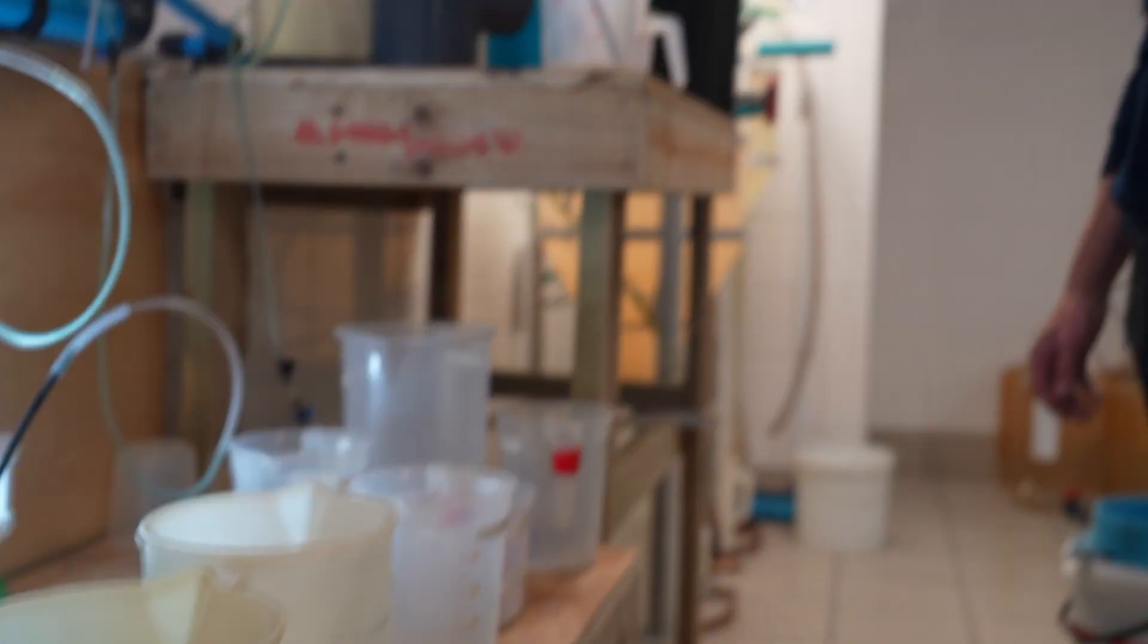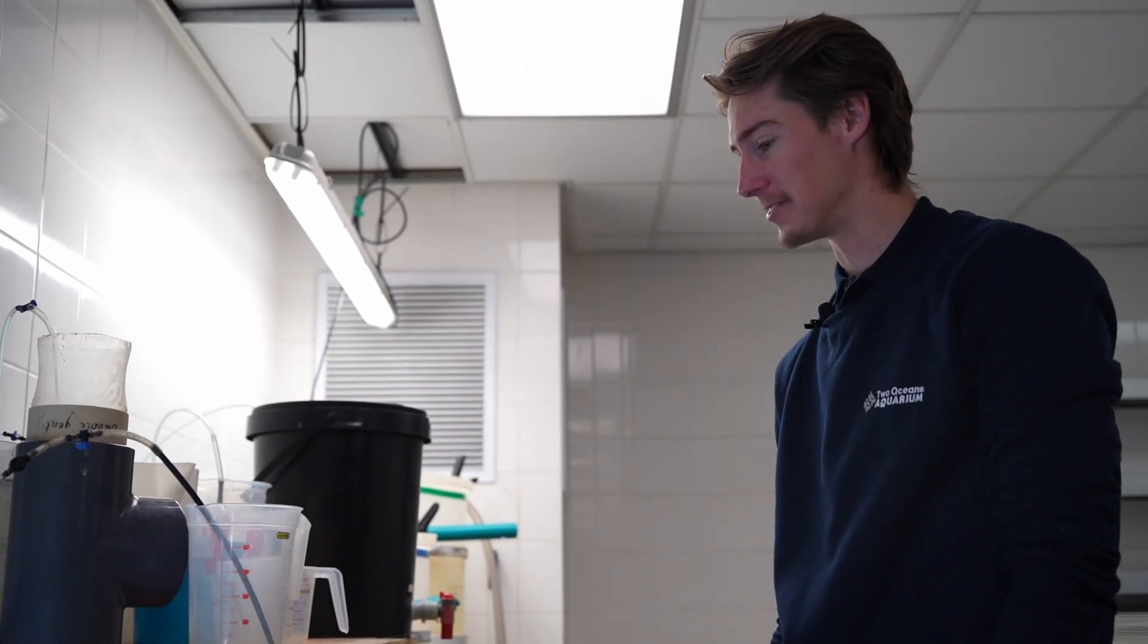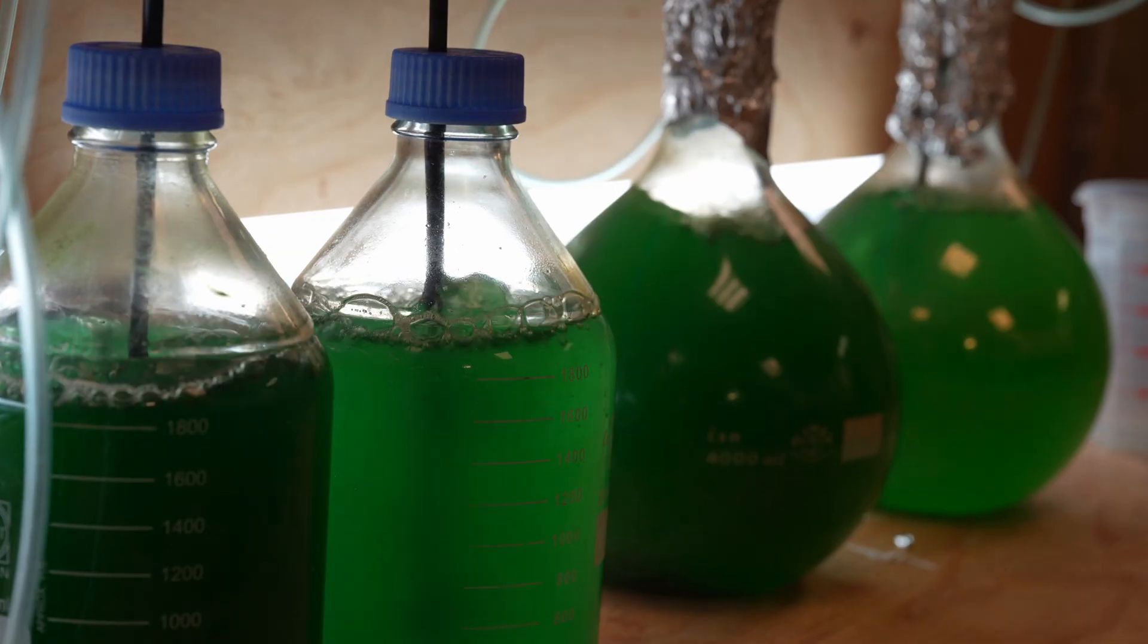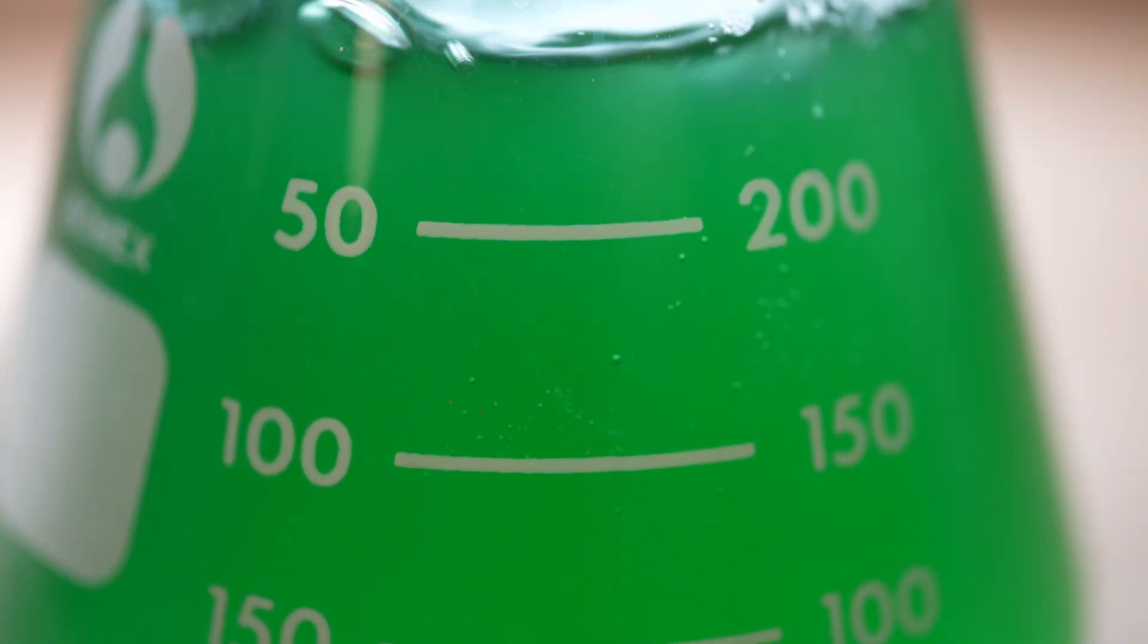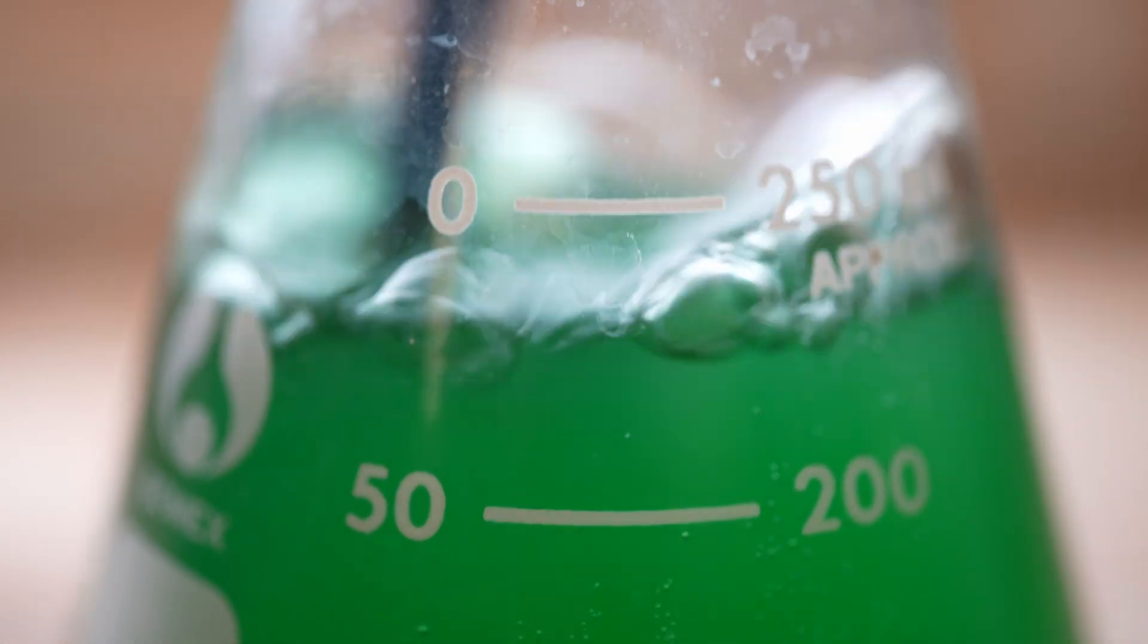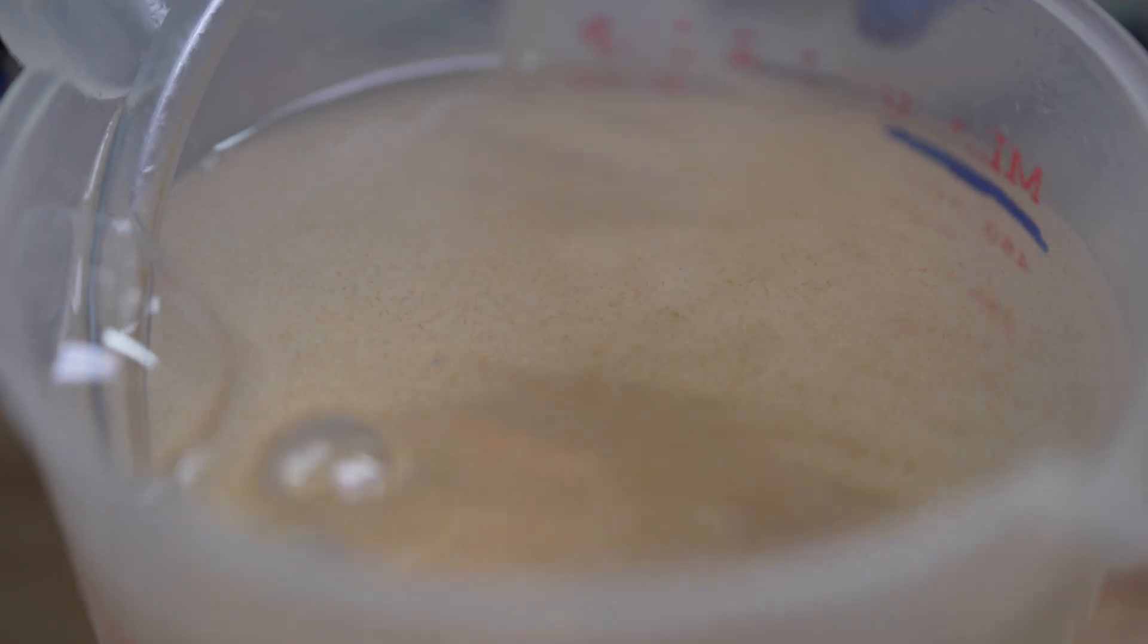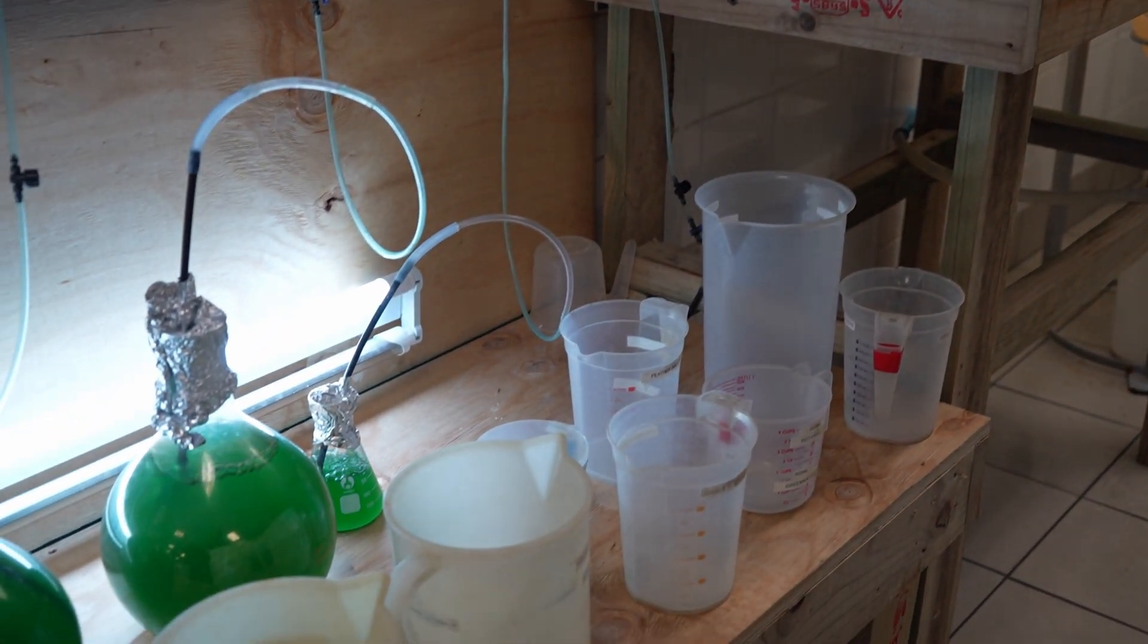Basically how we lay it out at the moment, because it's very temporary and we still have a lot to add, we've got our green water sitting on the left here, on the bench, because it's with the other green water and we are concerned about contamination. We've got green water down here, and then we've got all the things requiring air, your artemia bubbling on top here. And as we condense the different cultures, we'll then distribute them accordingly into these jugs.